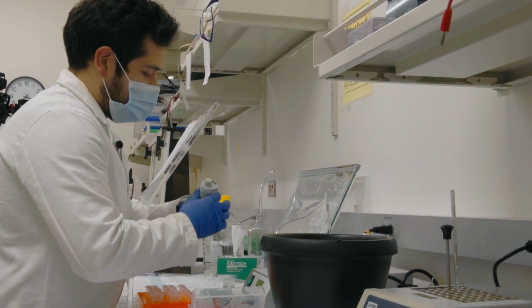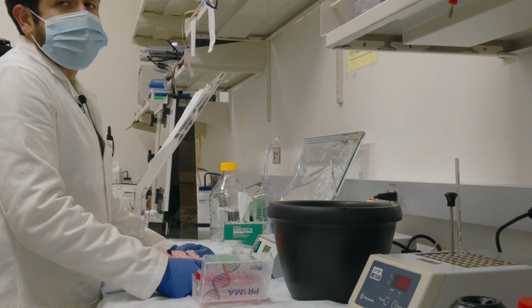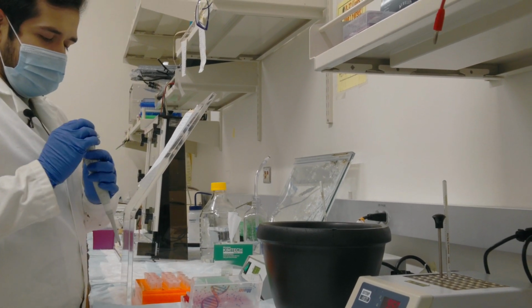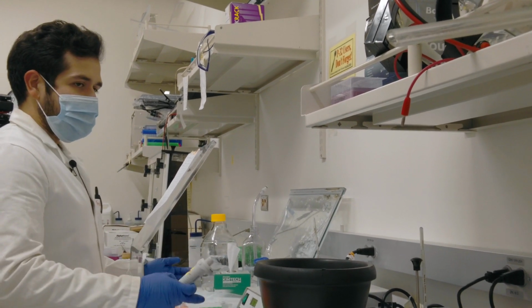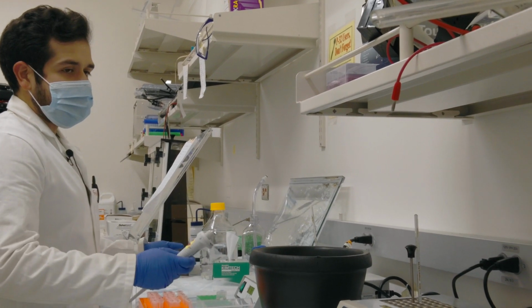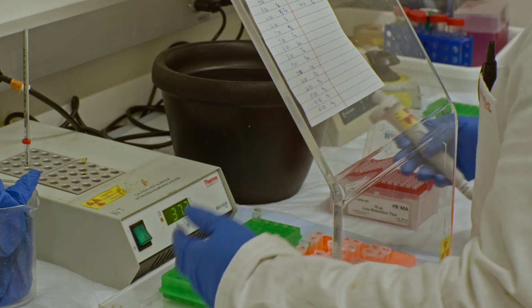For DNA annealing, what we do here in our lab is that we usually take one equivalent of our radio-labeled primer to two equivalents of our template strand. So the reason we do this is because by doing these kinds of ratios, we ensure that all the primer gets annealed onto its template strand. The rest of the template strand that doesn't have a primer won't even show up on the radiolabeled gels. Because again, since we're doing phosphor imaging, the only thing that should show up on the gels is a primer.